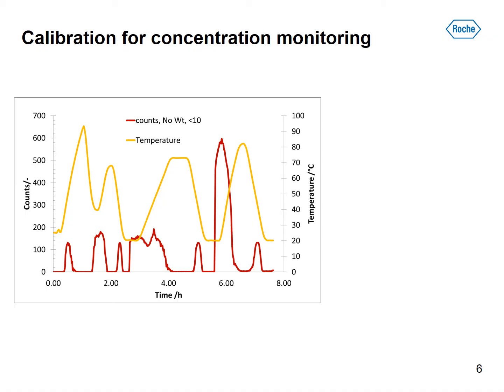Because of the ATR technology of the IR probe, we can only measure the API that is in solution and not the one that is in a particle. When we had the increase of fines, we added some further solvent to dilute the API, heated up again to the clearing point and cooled down. We ran several cycles so that we could measure at 6 different API concentrations over a broad temperature range.